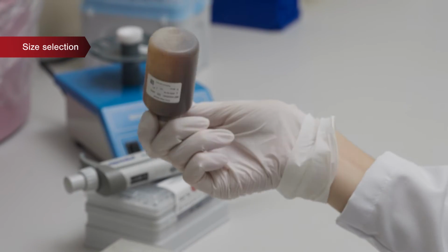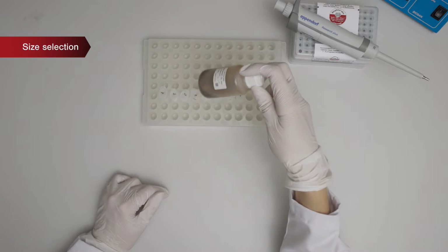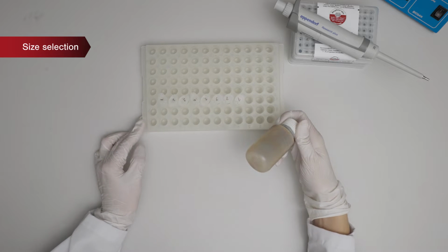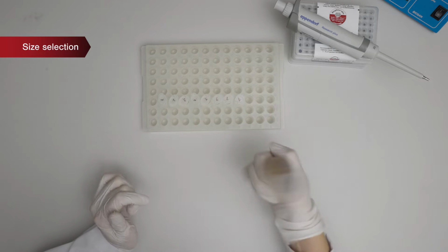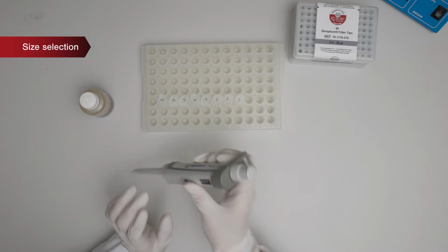In order to perform the double size selection, the supernatant from the previous size selection is mixed with the second corresponding volume of beads, which is 20 microliters at this time.